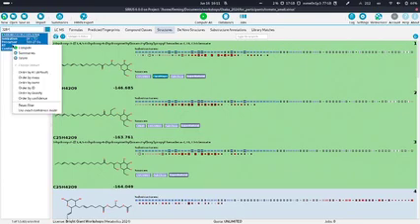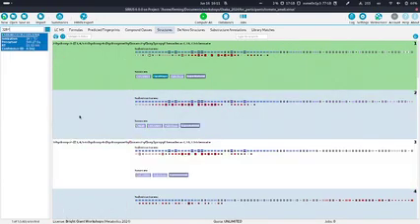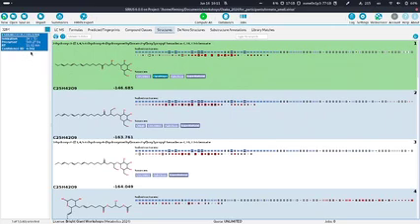And if we go back to what we had before in SIRIUS 5, the exact confidence mode, you will now see that first the confidence is much lower. We only have 0.5 instead of 0.7, and you will only get 1 hit because this confidence mode only considers the top structure and not structures which are very similar to the top structure.